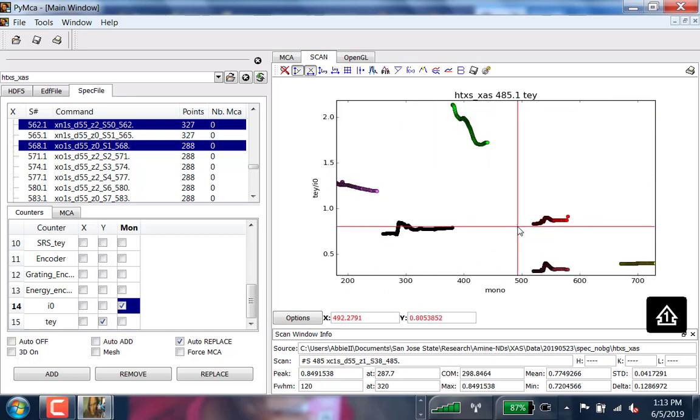Overall, I would assume that any of the oxygen that might be on there could still be related to the unreacted carbon-oxygen bonds on the surface, the acids that might be on the surface, as well as maybe even adsorbed water. We always want to say that our samples are dry, but we know that's not in fact the case.